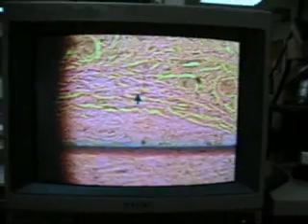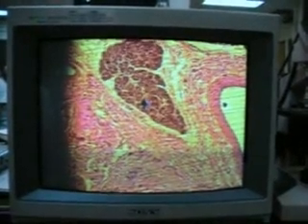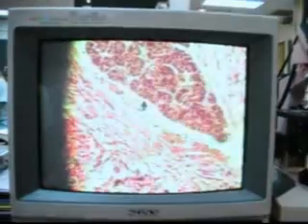I'm going to work on this microscope for just a second, see if I can make this a little bit easier. Someone asked if I said 'friable' — yes, like I'm going to fry a piece of fish. I need to eat; my hands are going to be shaking. Sorry about the video shake.